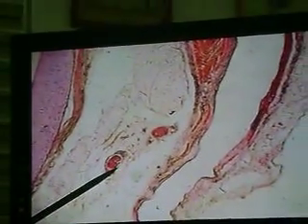Let me look for other little gross features on this slide. So we've looked at the more micro features. Let's look at some of the more gross features that we may encounter. A little fat over here. Bit of the esophagus back here. Once again, watch here. That's the recurrent laryngeal nerve. Right in the tracheoesophageal groove, we find the left and right recurrent laryngeal nerves.